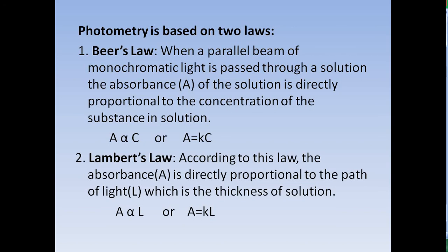If the concentration is high, the absorbance increases. If the concentration is low, the absorbance decreases. Let A be the absorbance and C the concentration.